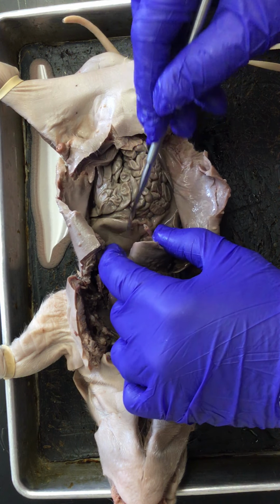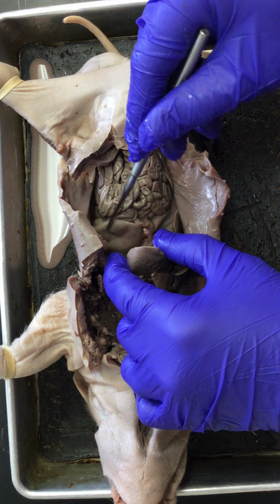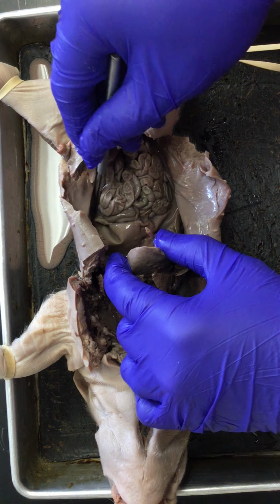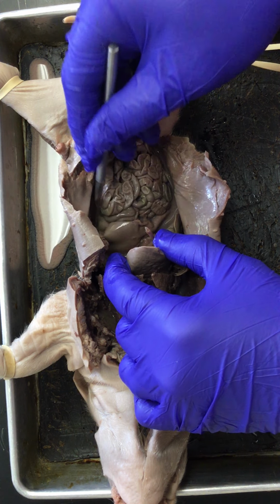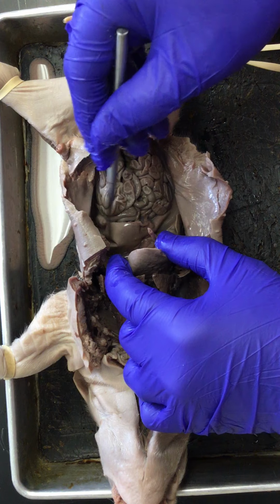Tucked under the liver is this pig's stomach. So right here, this more squishy, looks like a bag that is semi-filled with some digestive juices. Because this pig was still fetal, it hadn't yet been born, it hasn't eaten anything yet, and so these are really just digestive juices, plus probably a significant amount of preservative that this pig's been soaked in. So here's the pig's stomach.